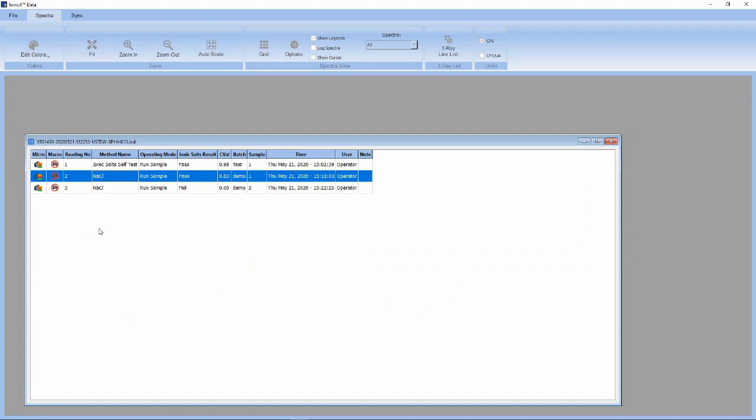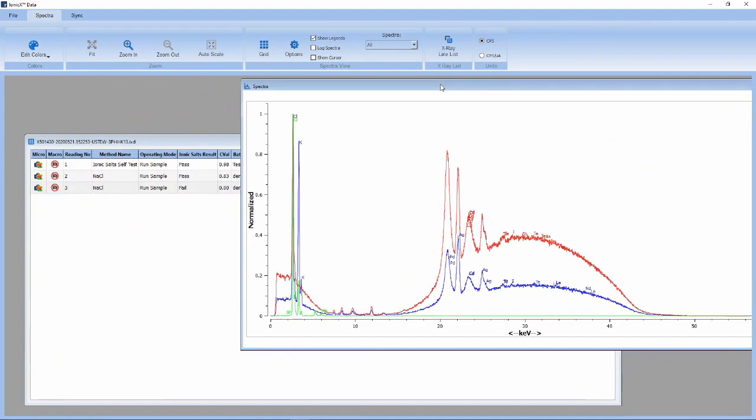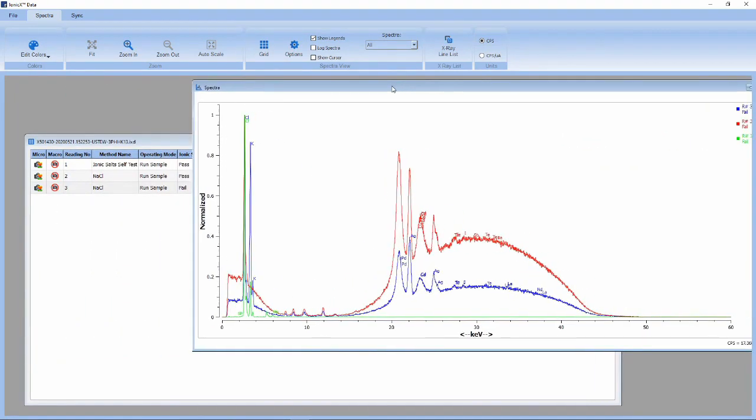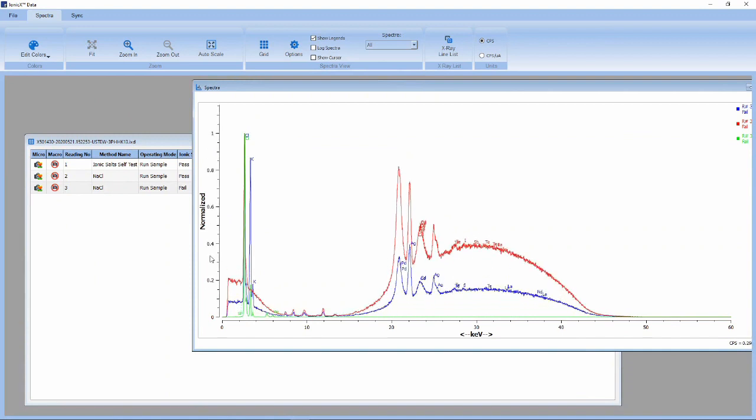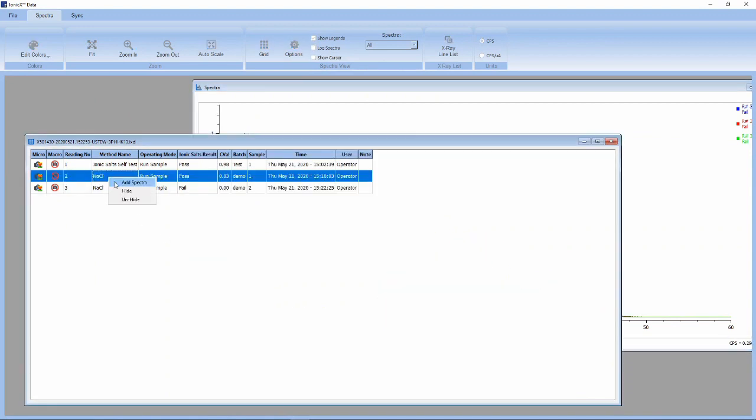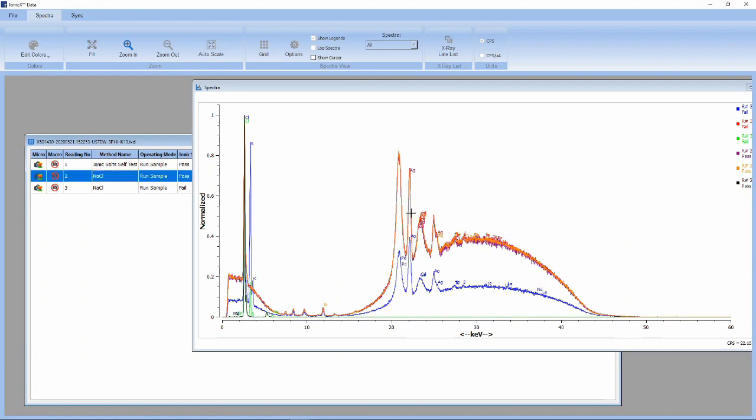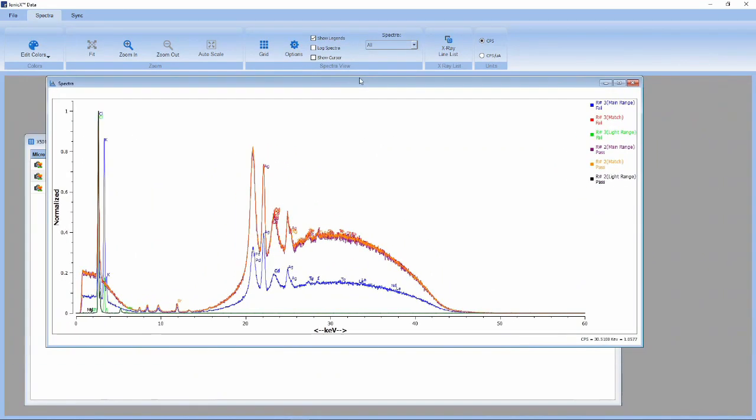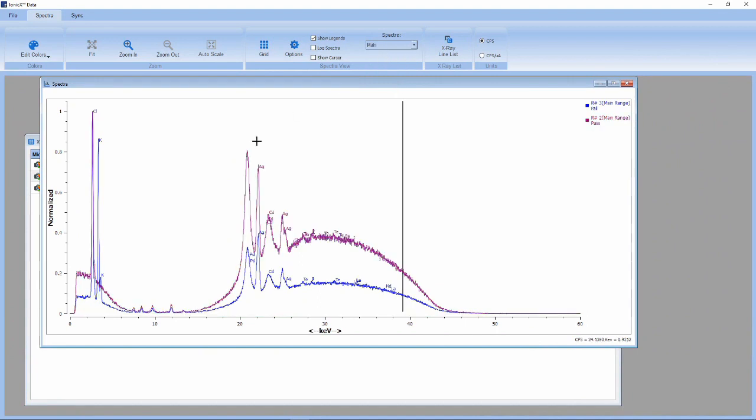Looking at the failed sample, we can see some spectral differences right away from peak location and intensities. Selecting both the pass and fail spectra, we can overlay them and see how they match with one another. Selecting the main spectra to view, we can see immediately the difference in peak locations and intensities.